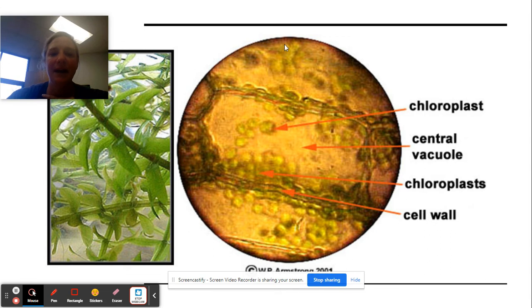This is for a plant cell here. And in a plant cell, if this is one cell that we're kind of zooming in on, it's hard to see the outline, but in the center where you don't see anything else, that is the large central vacuole. The green parts in a plant cell would be the chloroplast, and outside you can see a rigid cell wall.